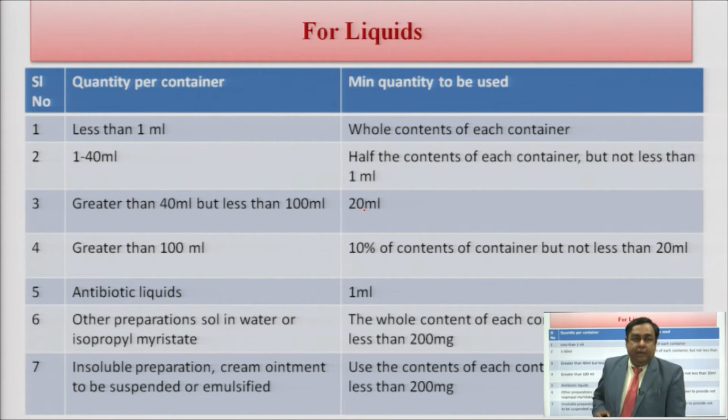If the preparation is antibiotic in nature, we need to deactivate the compound, we need to mask that compound so that it should support the growth if there is a presence of microorganisms.